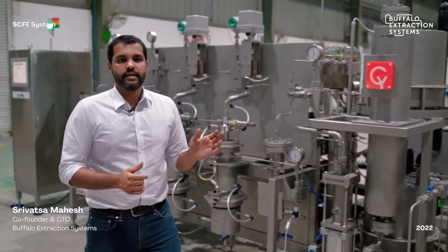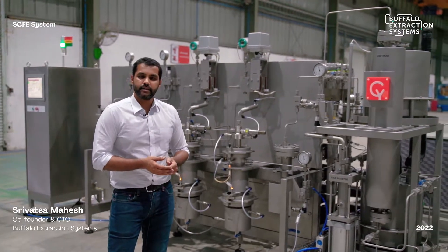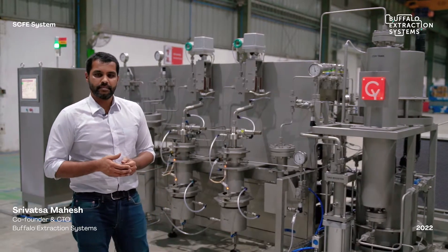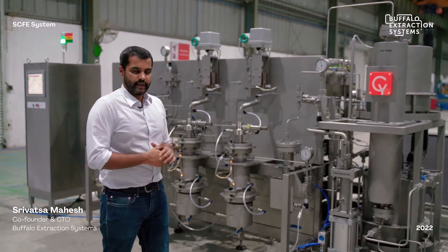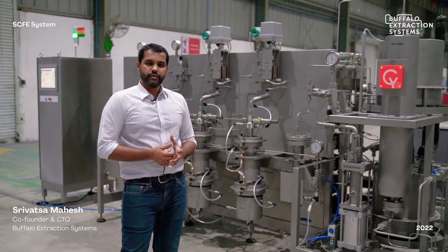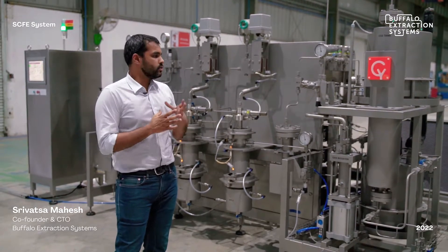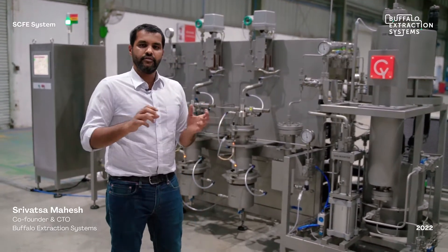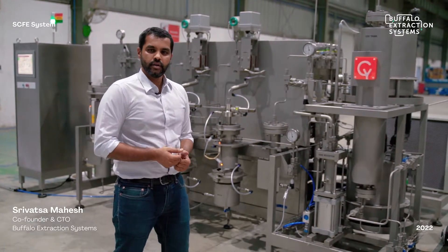The complete system operates on 3-phase voltage, customized per country — for the US it is supplied at 480 volts AC at 60 Hz, and for India at 415 volts. It also requires a dry compressed air supply of about 20 to 30 CFM at 6 bar pressure, for which you would need an air compressor, as well as CO2 storage tanks with a manifold and pipeline connected to the plant.